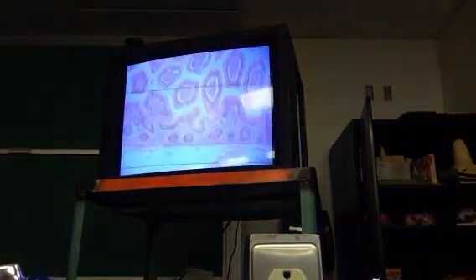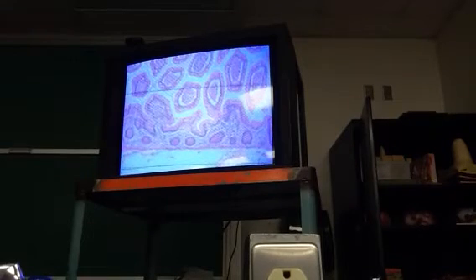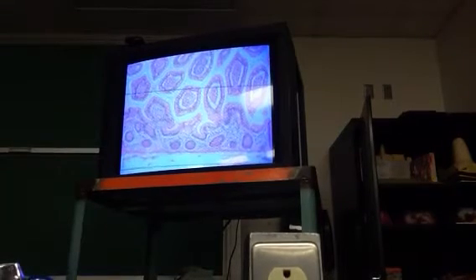That's from there up, then is mucosa. You see your villi, your intestinal glands, simple columnar epithelium with goblet cells, brush border, lamina propria. All of that is in there. Now, here's our, let's go this way. There's Peyer's patches in the mucosa.